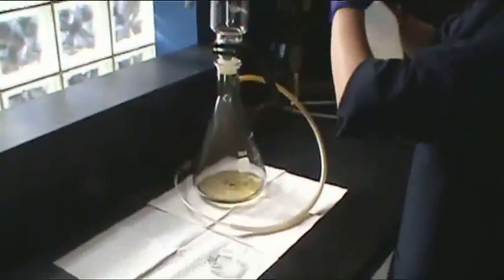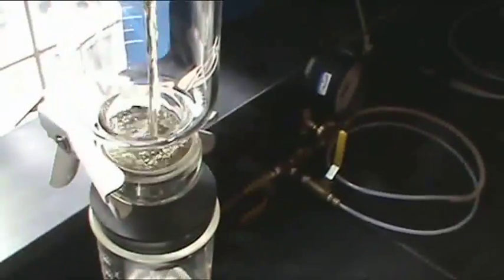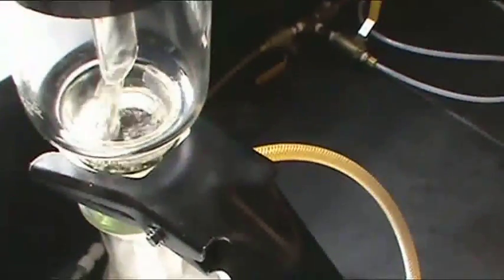In the apparatus, the 30-micron patch sits above the 5-micron patch, allowing smaller particles through. This new test method also prevents patches from clogging since the top of the apparatus is interchangeable.